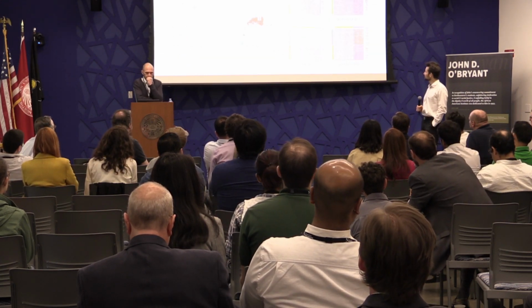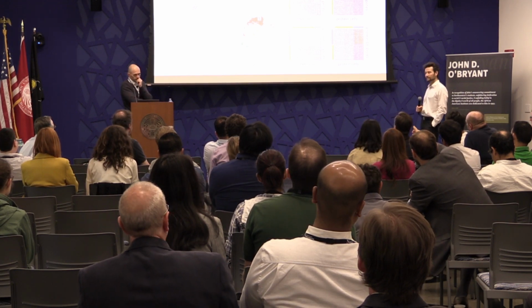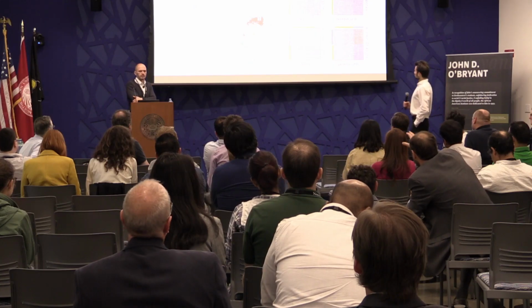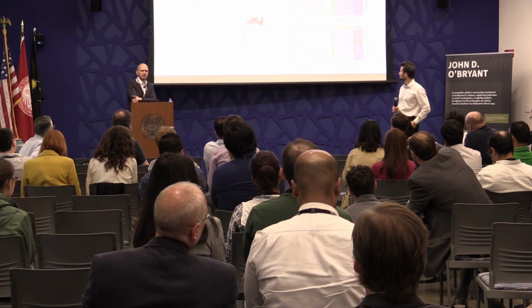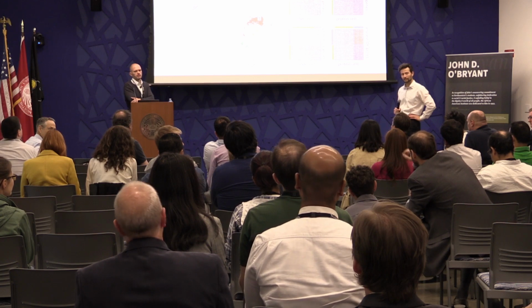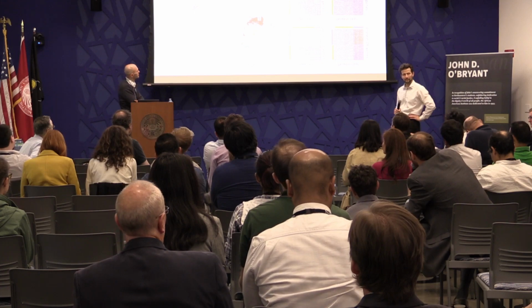Does this mean, in your opinion, if you go to the second squares, go back to the RNA-seq, where we don't see the good separation here, and all those genes have been used in, for example, the previous data set where you took them from, the RNA-seq? I'm not sure how big this list is. Is it 1,500 lines? It's 200, 100 on each side. Yeah, for example, 200. Does this mean that if any of those 200 in the original set were used to make a grouping in the original RNA-seq paper, that has nothing to do with the proteins? It's just a picture being drawn by RNA.